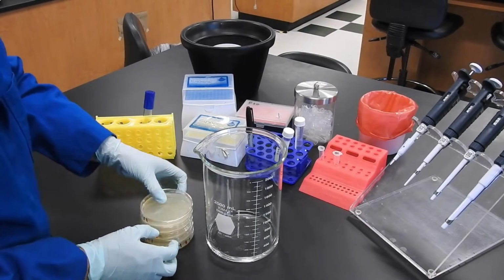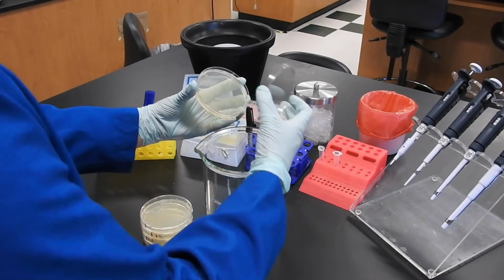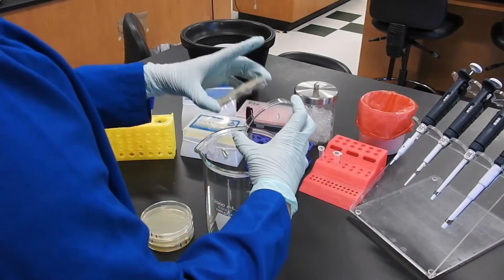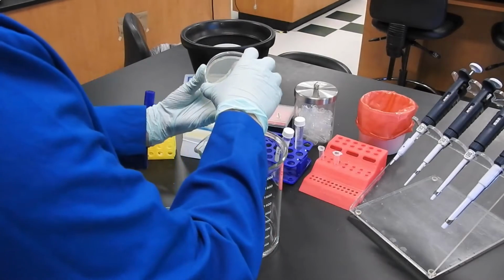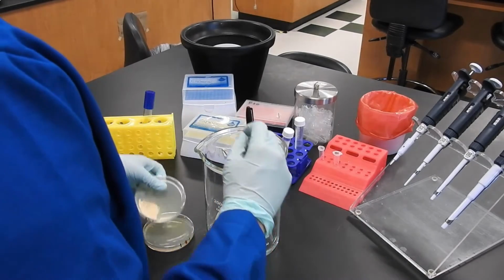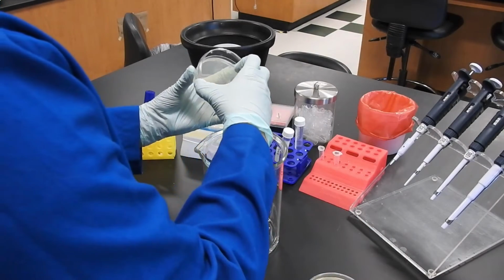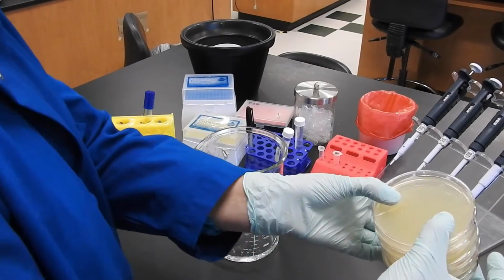The beads are removed from the plates. They will be washed, sterilized, and reused in future experiments. Now my plates are ready for the incubator.